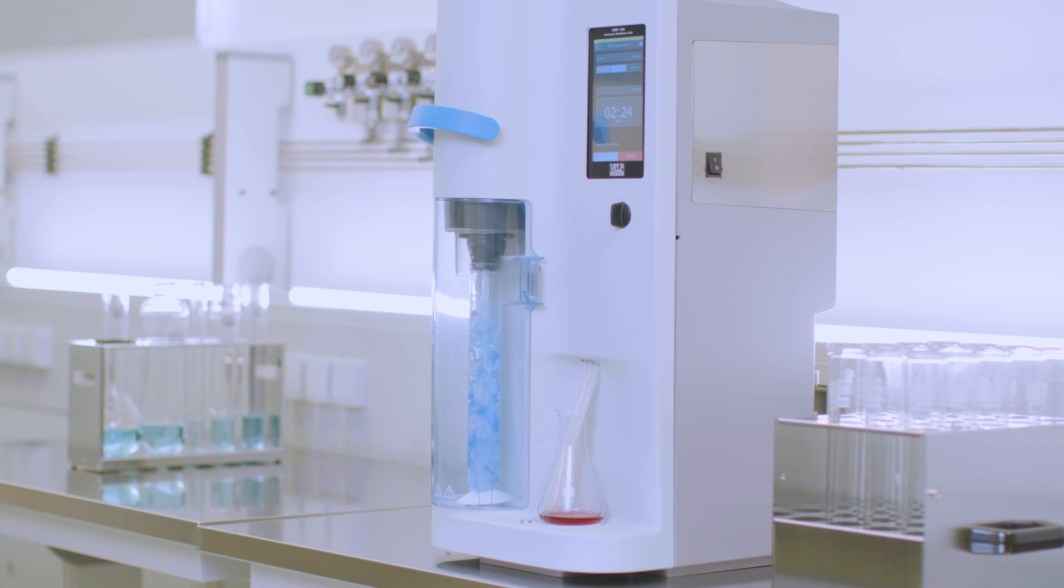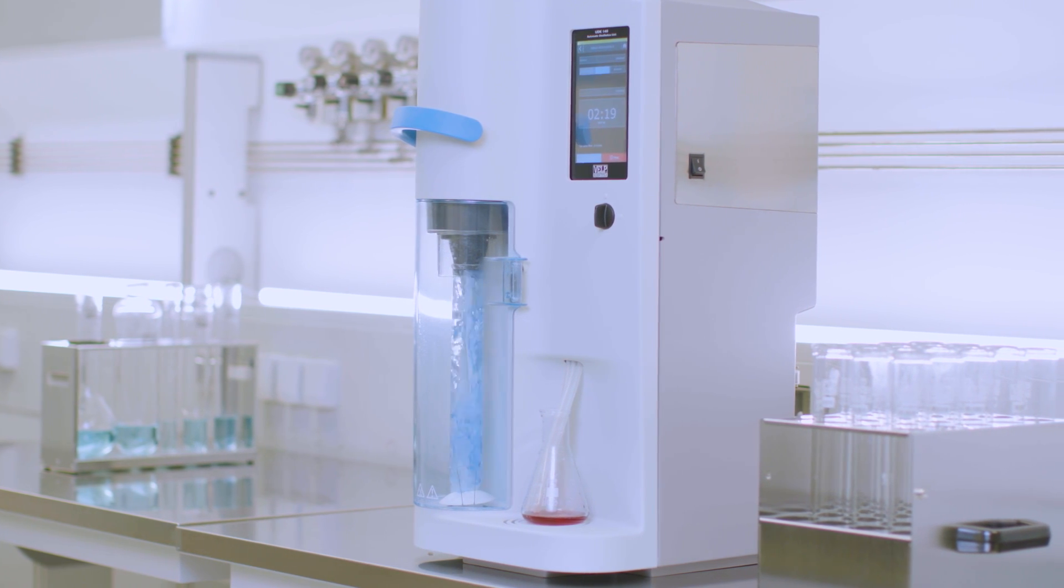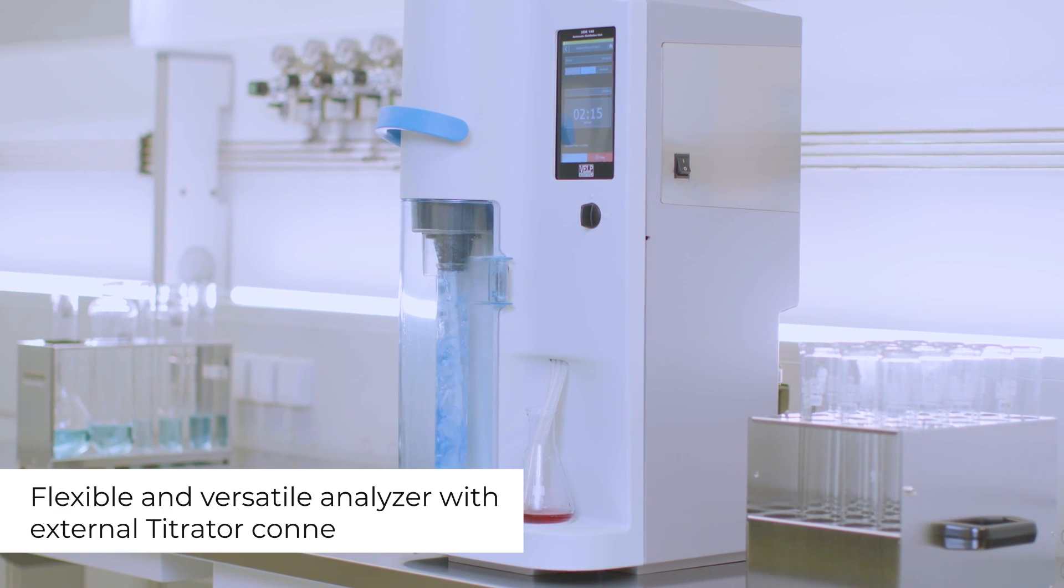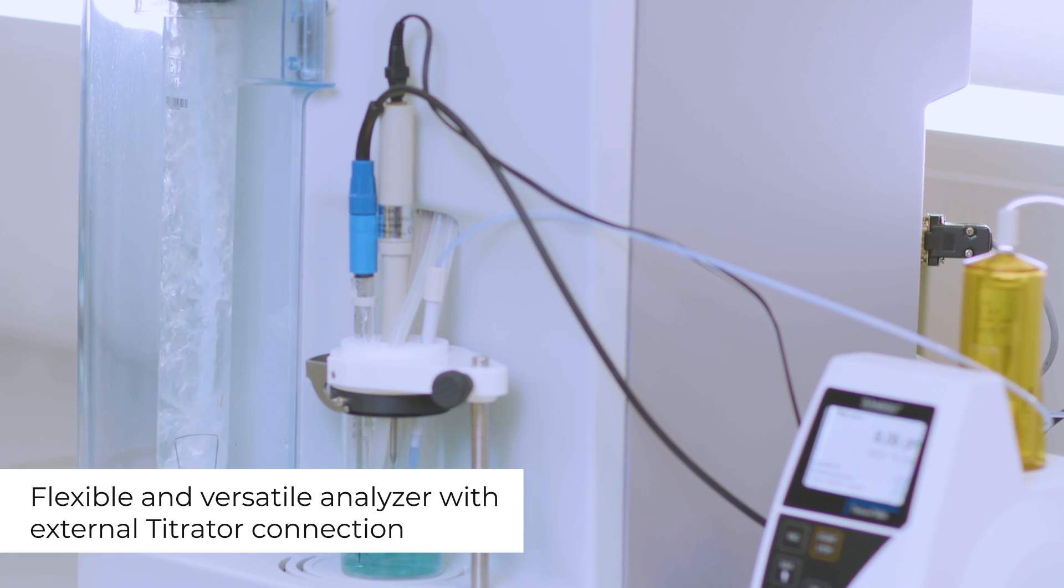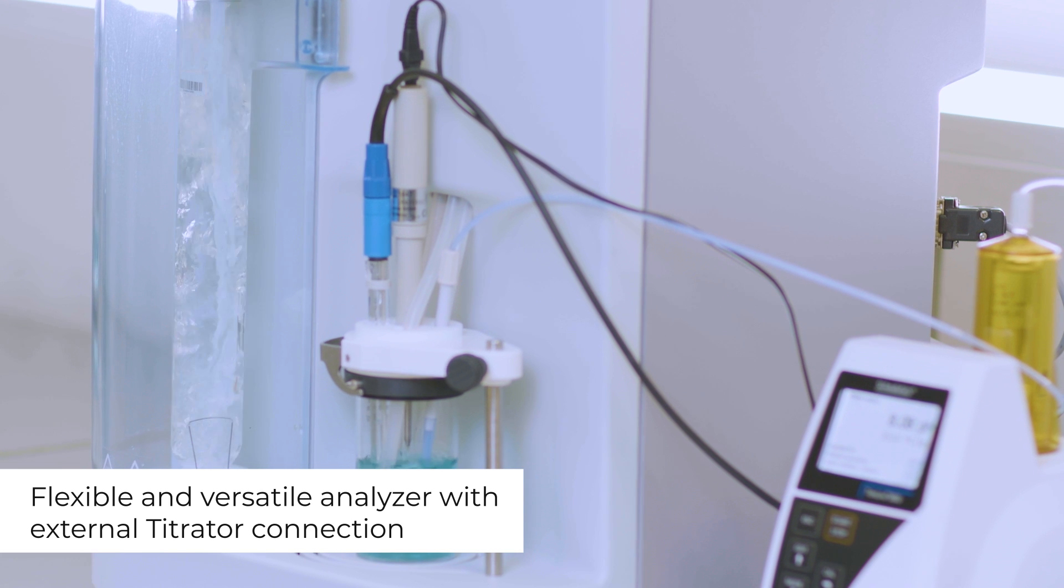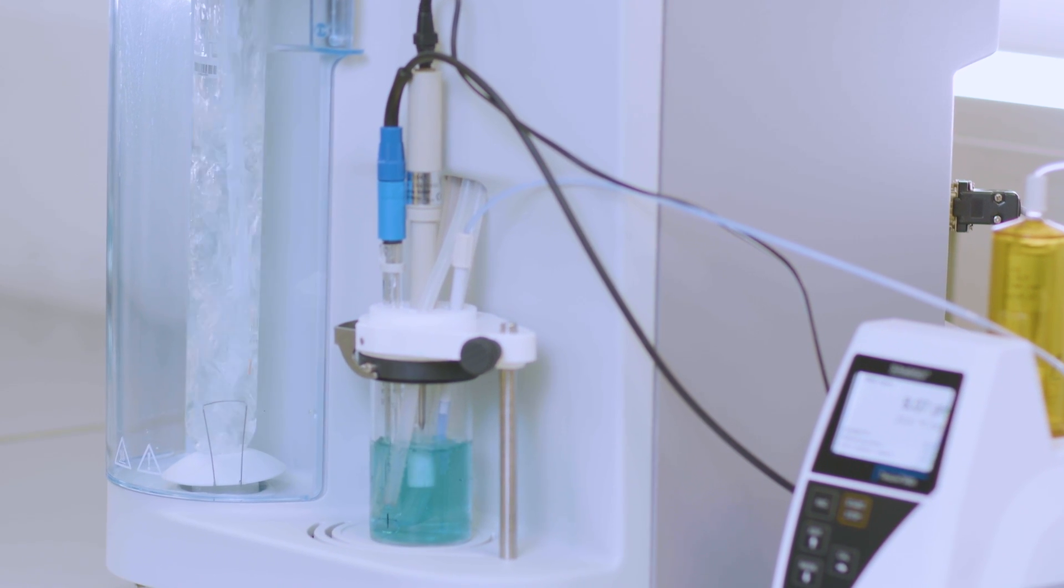The UDK 149 incorporates state-of-the-art technology offering the highest versatility and flexibility thanks to the ability to connect to various external titrators for simultaneous distillation and titration.